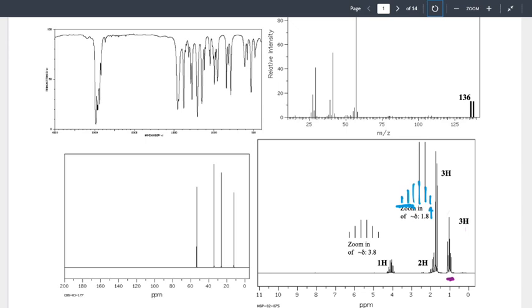Should I count it? All right, well, think about the house next to you. Does it have more than one person in it? Okay, yeah. Do you have the same relationship with each of those people? Slightly different. Okay, they share a house, so they may have similar tendencies and you may have similar activities, but you're going to interact with them slightly differently. You have to count both of them. So this hydrogen sees 2 neighbors.